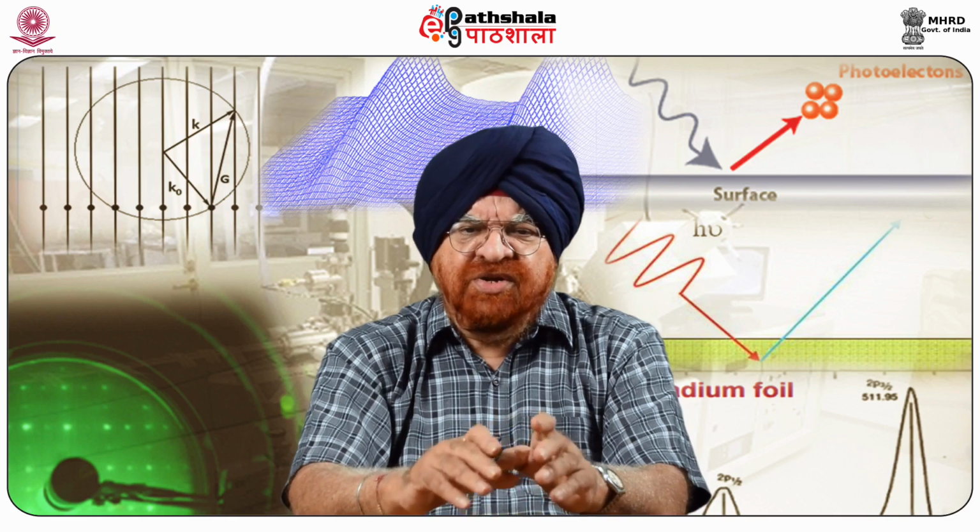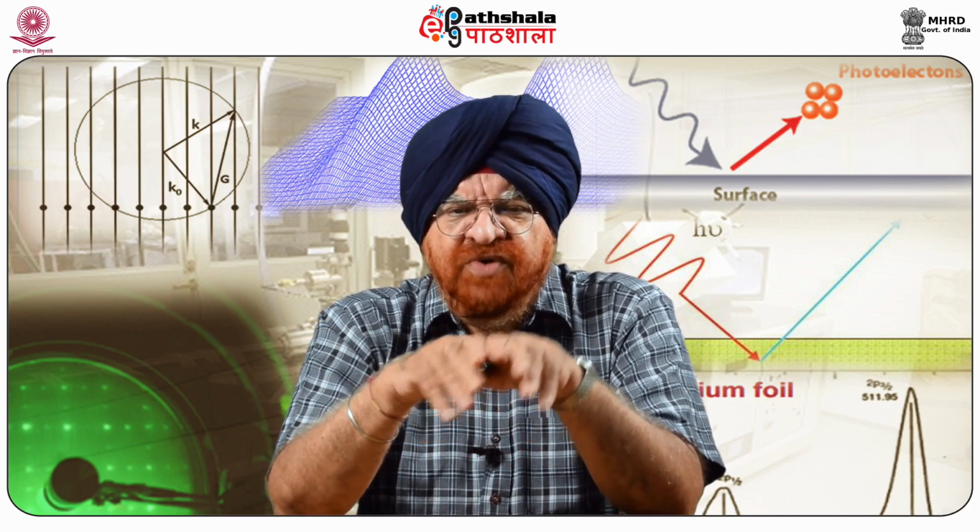module. Interaction between chemical functionalities defines outcomes of the vast majority of important events in chemistry, biology, and material science. Chemical force microscopy, a technique that uses direct chemical functionalization of atomic force microscopy probes with specific functionalities, allows researchers to investigate these important interactions directly.